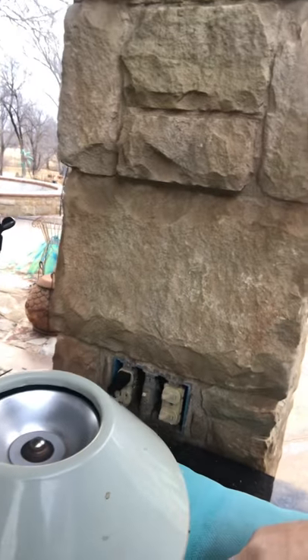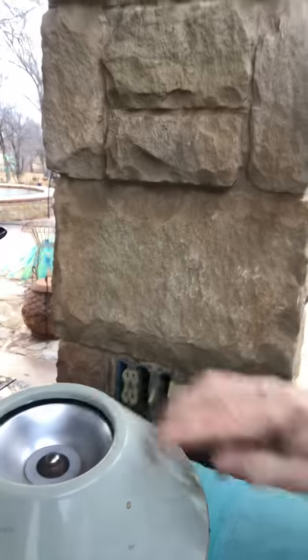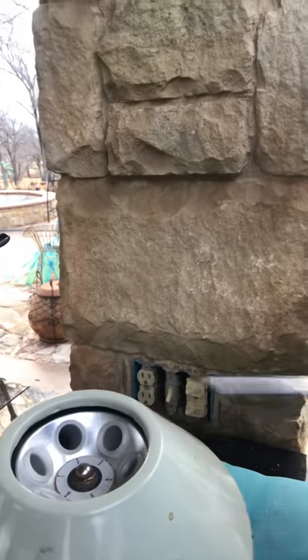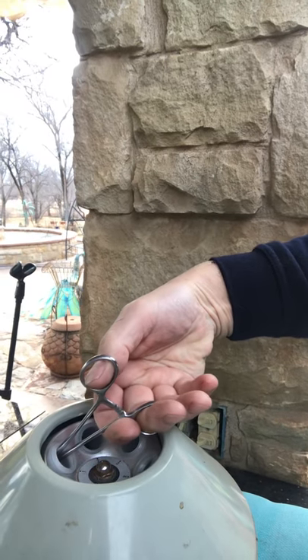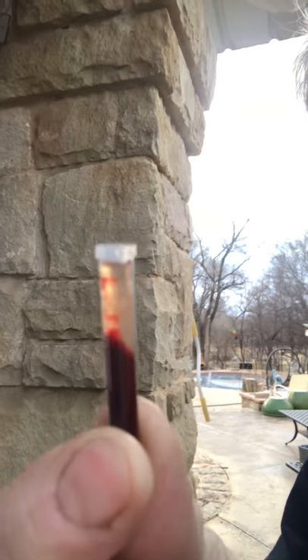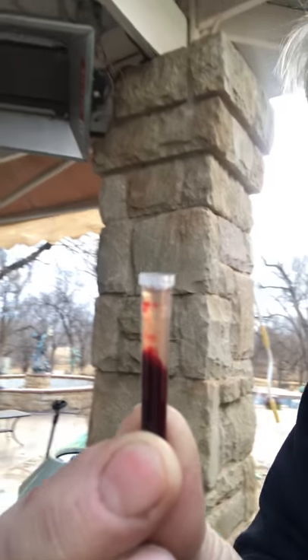This hasn't been running long enough yet, but let's see where we are. You need a pair of hemostats because the little cap sits down inside the centrifuge holder. And there it is — it's already separated. You can see the red blood on the bottom and the plasma on the top. I just need two drops for the test, and there are probably ten drops in there.